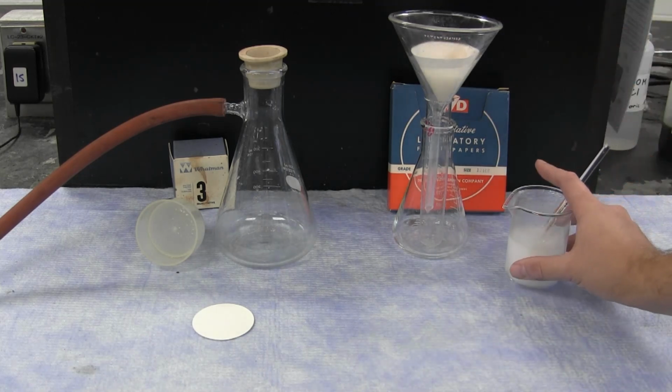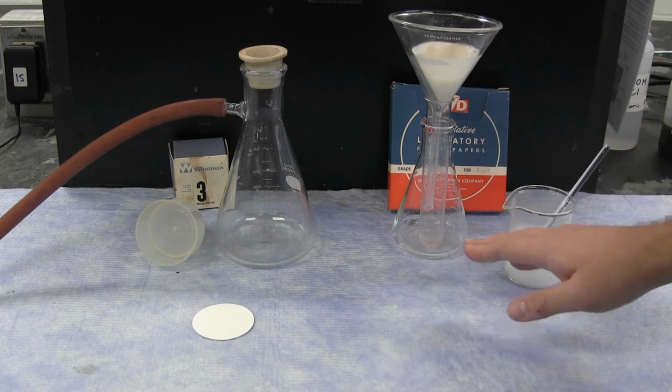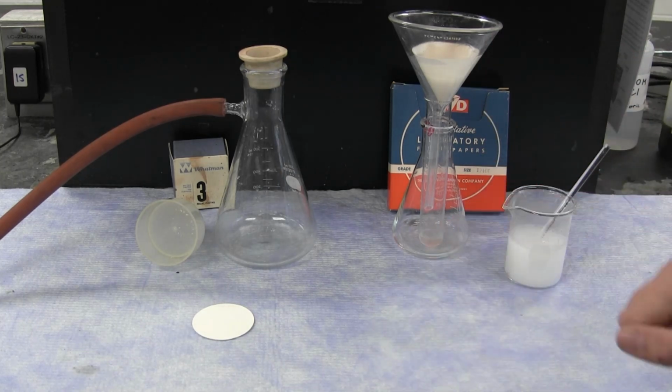It's called gravity filtration because the only means to draw the liquid through is by gravity. The liquid that passes through the filter paper into the container below is called the filtrate.